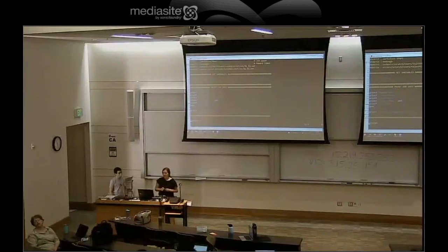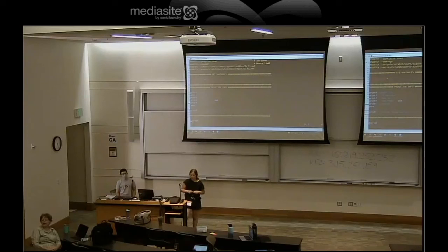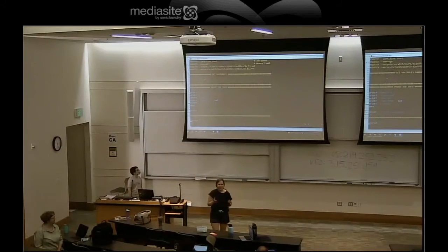So this is what we're doing tomorrow morning. You don't need this right now. Tomorrow morning, after we do the capstone, which will be a little longer than normal, the first thing we will do is run feature counts, which is counting reads per feature. The reason we're learning R today is because tomorrow you have to be able to make an R script that you then run. And if you don't know how to write in R, then you won't know how to make an R script. But like I showed you in that R script, a lot of that stuff looks familiar, right? Like data directory, output, et cetera.